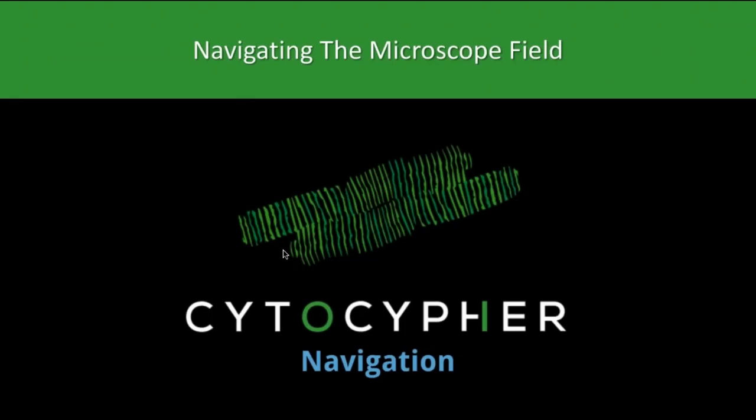What I'm going to show you next are 4 movies that explain the operation of the microscope and what you can do with it. The first one is about navigation. You don't have oculars anymore, so you need a way to navigate through the microscope. We only have one objective, so we have to figure out how to give you a proper overview. These things are being shown in the movie.